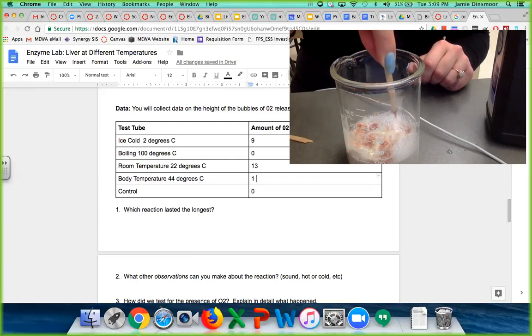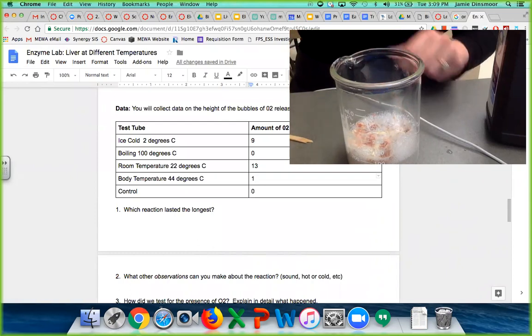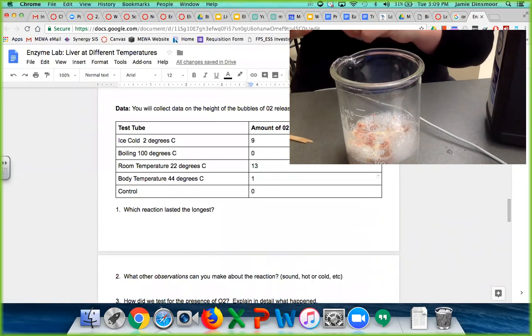It's hard to get close enough to the oxygen without putting the ember out. Oh. Which I just ended up doing on that one. Good thing I have a lot of sticks.